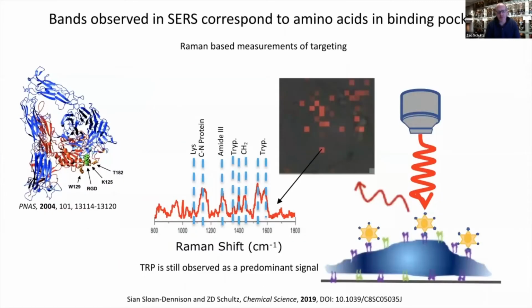Let's go back just one second. The challenge with doing this is that in this image now, we're diffraction limited again. So with our TERS imaging, we were able to look at things with 10, 20, 50 on a bad day, nanometer spatial resolution. In the wide field image, we're back to hundreds of nanometers. And we wanted to find a way to improve that.